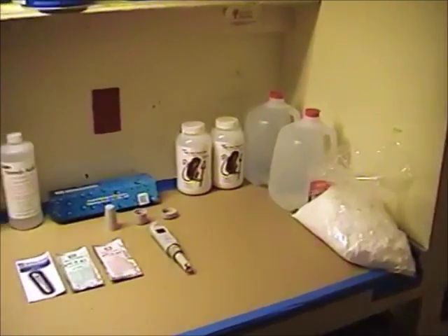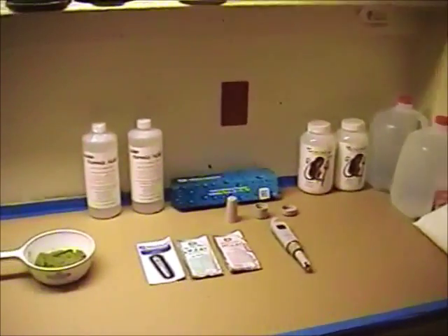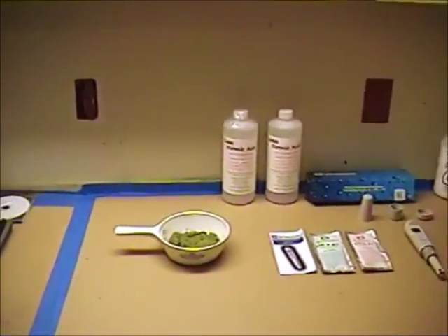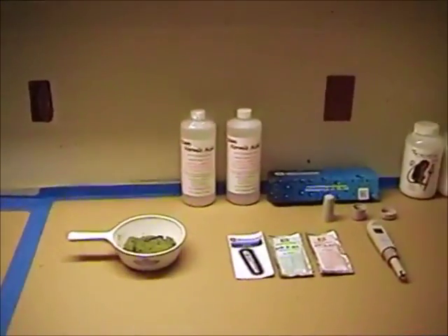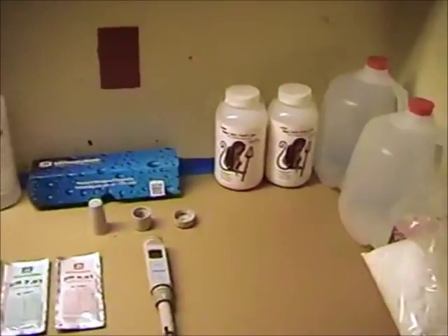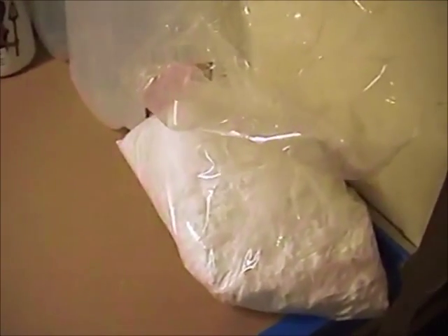What I'm going to do here is show you a few items that we're going to be using in our experiment and run through each item, what it does, and how we're going to use it. The first item I have over here is a five-pound sack of sodium formate in dry powder form.